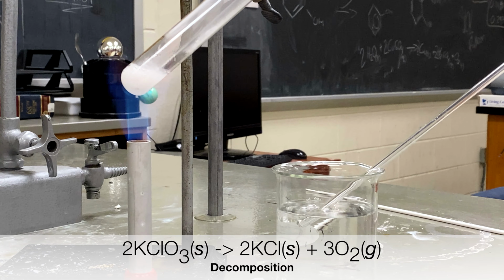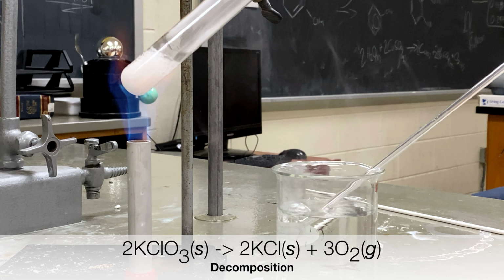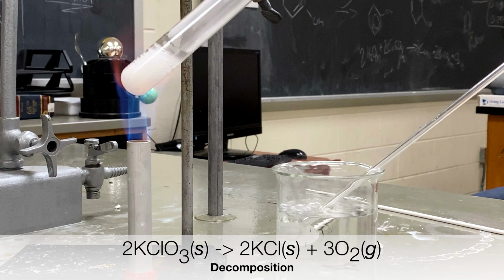All of a sudden, you can see bubbles start to emerge from the liquid, and more bubbles rapidly start to come out of the water. That's because we have reached the point where the decomposition is occurring. Oxygen gas is now being released, and potassium chloride is starting to form in the test tube.